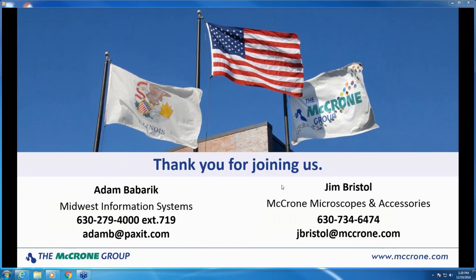And not only have we designed it as such already, but we continue to update the software in order to continue to meet those types of needs. So it really is a robust solution, much more than just a capture and make sure it's secure type of one-two.